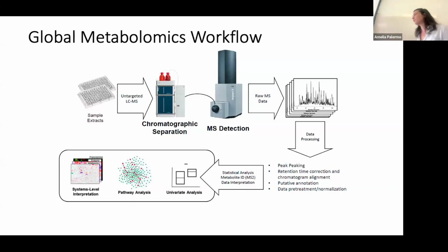But as in most workflows, the next step is the LCMS platform, so the chromatographic separation. The chromatographic separation can be performed by using different columns with different stationary phases. But why do we do chromatographic separations in the first place? Based on what I told you, does anybody have an idea of why we are complicating our life to add an additional dimension of information?